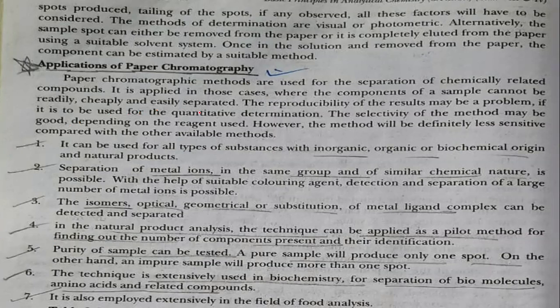So where can we use paper chromatography? Is this technique really applicable in our day-to-day life, or does it have much importance? Yes, it does. It can be used for the analysis of inorganic, organic, and biochemical substances. It is used for the separation of metal ions, to separate groups having similar chemical character, and to separate isomers. Optical, geometrical, and substitution isomers can also be studied with the help of this technique.